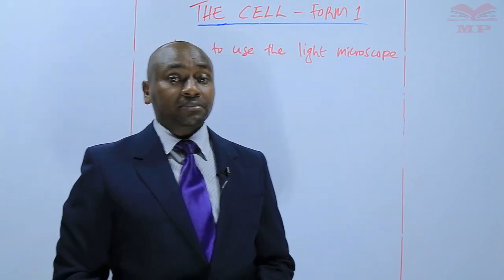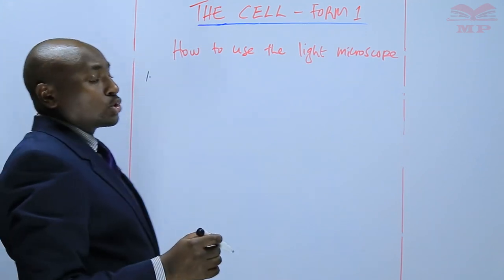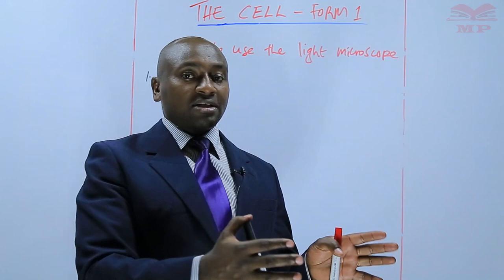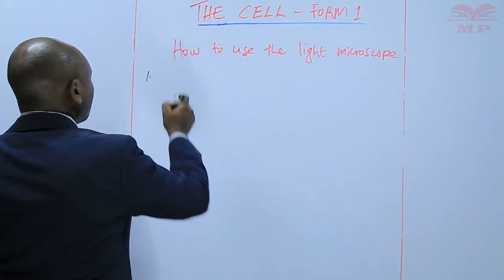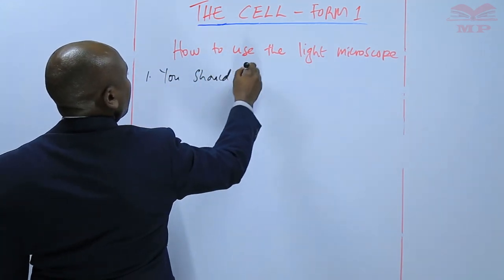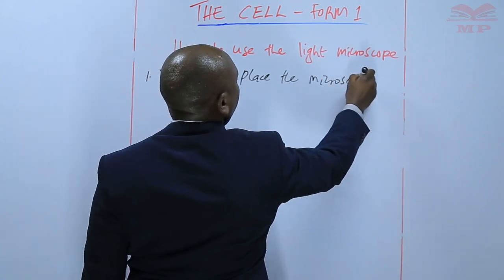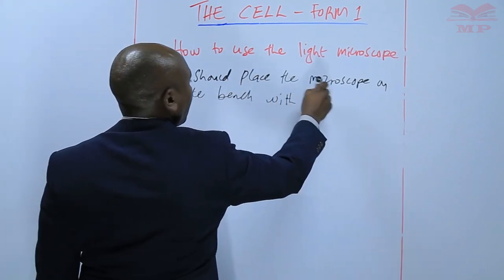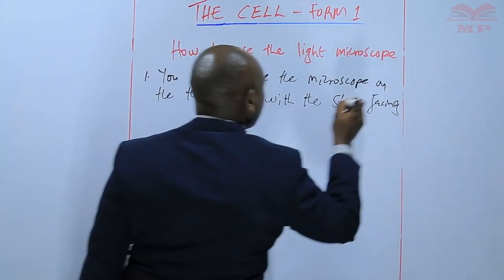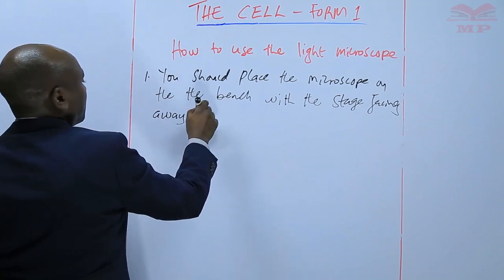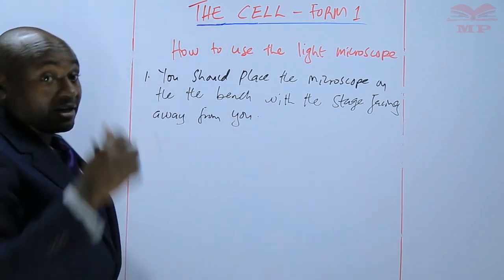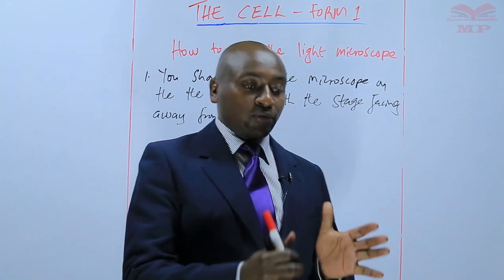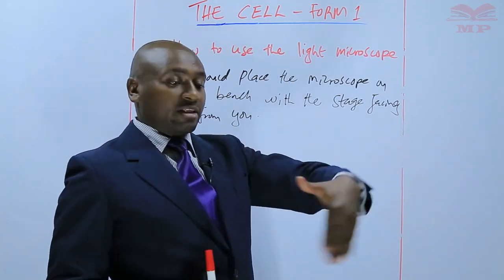The first thing is that the learner should place the microscope on the bench with the stage facing away from you. This is very important because when the stage is facing away from you, you do not obstruct the light. You should be on the side that has the arm, and then on the other side the stage should be away.